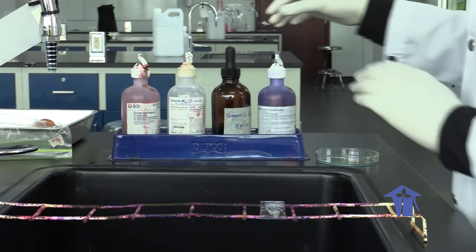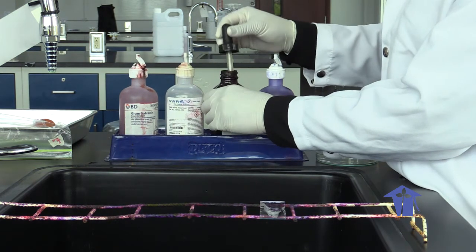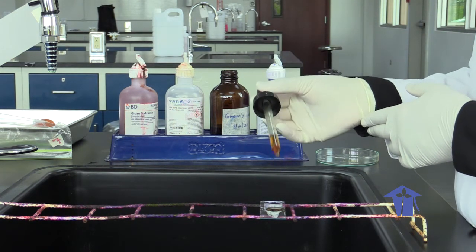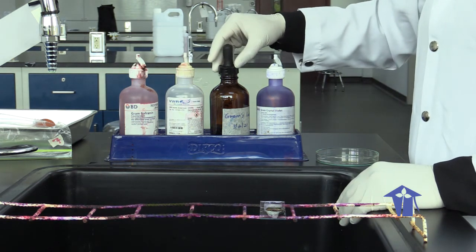Next step, we apply Gram's iodine, 2 to 3 drops of Gram's iodine, and we're leaving it for 1 minute. So you start your timer for 1 minute.